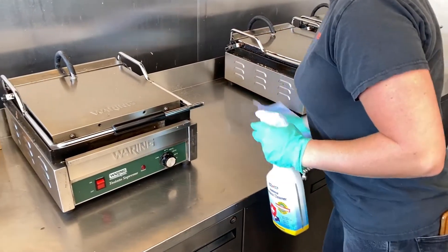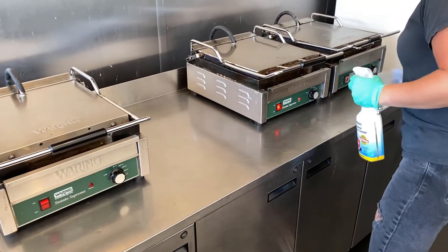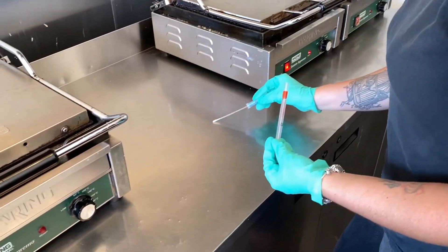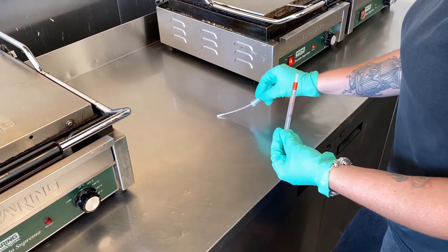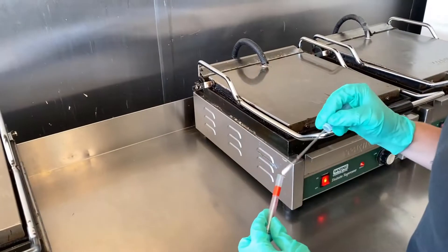We're often asked to prove how effective Bacoban is as a disinfectant. Fortunately, we can demonstrate precisely that. In this demonstration, our client cleaned the work surface using her regular cleaner, after which we got her to take a sample using a Hygiena Ultra Snap ATP Surface Testing Swab.